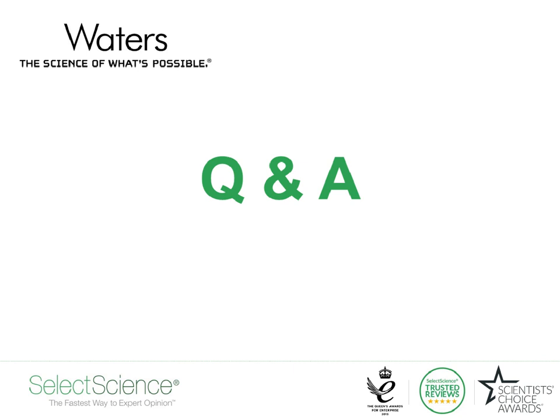What we've found is when we've been doing the quantification experiments, that adding in the ion mobility dimension to the complex data sets has helped the linearity of our calibration responses. And we think that's due to the fact that we are improving the specificity over simply using mass alone. No effect on the dynamic range that I could speak for, and sensitivity we haven't really compared.